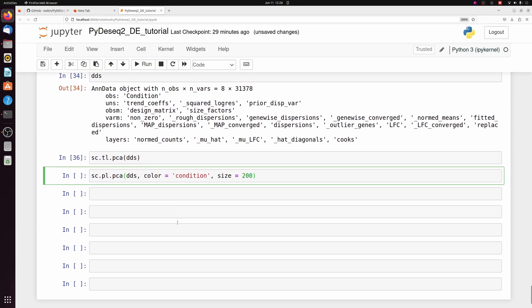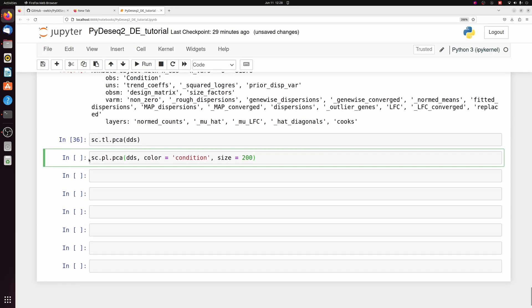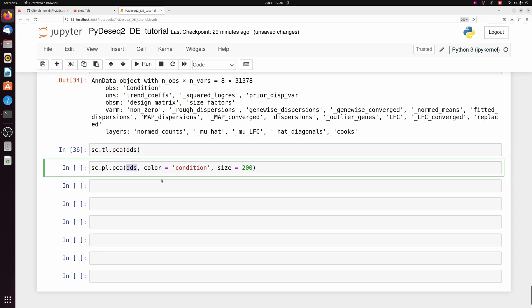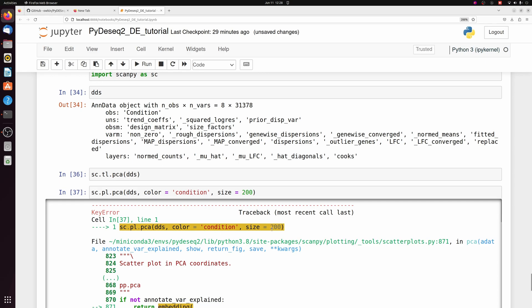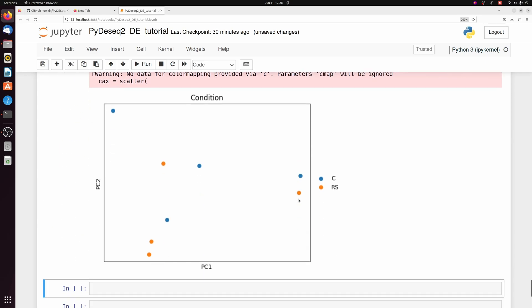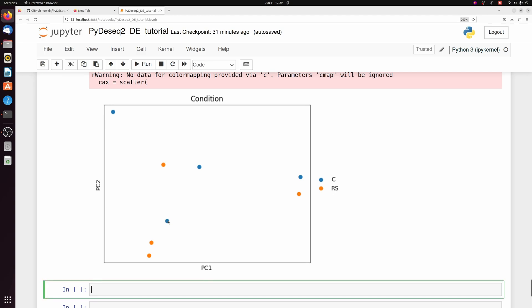So we're just going to do the scanpy tl PCA on our DDS object, and then we can just plot that. So we can do the scanpy plot PCA, DDS. And we need to specify condition is what we're going to color it on. And then we have to specify size because it's used to plotting thousands of single cell dots. So they would be very small if we don't specify at least 200. But you can play around with that number. I already know from working with these data in the past that the PCA doesn't look that nice. But here is the PCA plot. Of course, you would hope that your sample groups group together a little better than this.